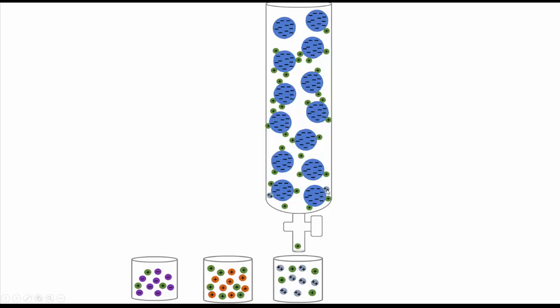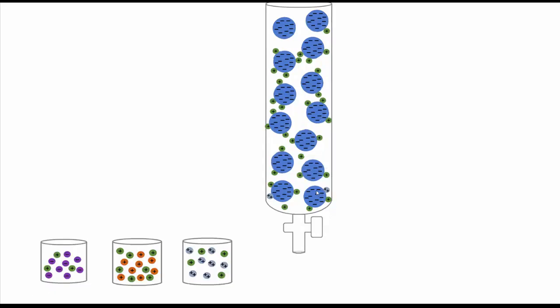As you can see here, I've left 2 in there because depending on what our mixture is, there could still be some positive ions left on the column at the end. Now there is a way to get that out. If there are any left over, we can flood the column with more of those sodium ions that we had before, and that way the sodium ions will go down and exchange with the double positive in order to flush them out.